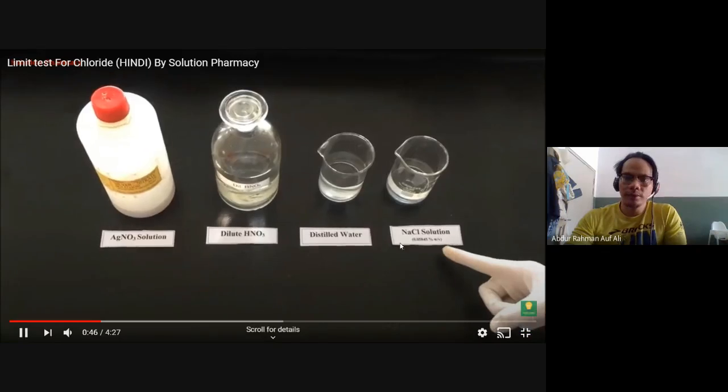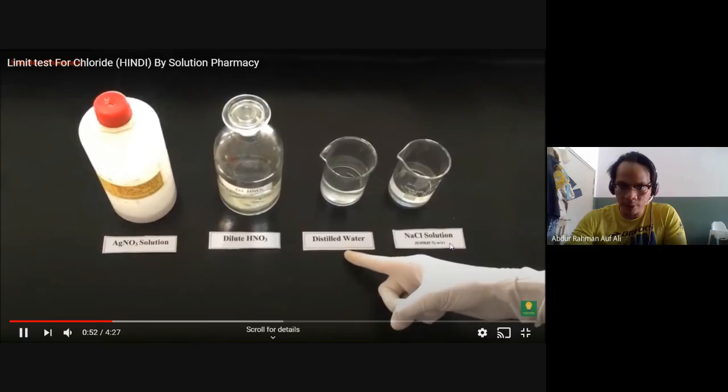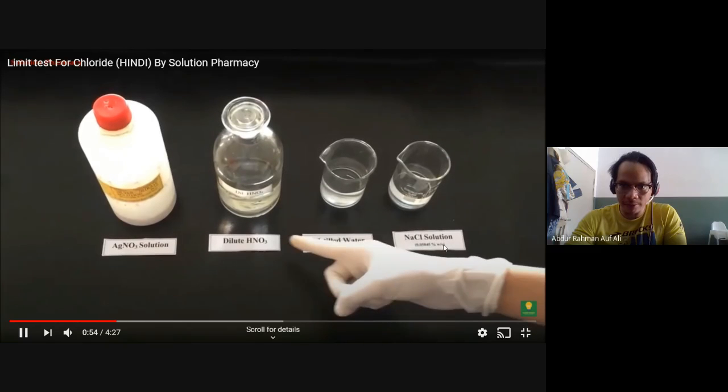So sodium chloride solution is our standard. Kita dah tahu dah. If you cannot see this, it is written here, dia punya content. How many chloride is in this?